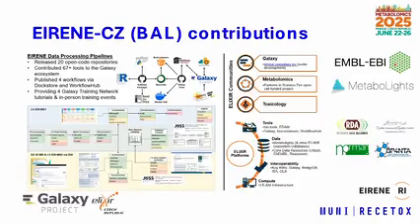So going there. Just as evidence of what we have contributed from my lab, I have to say again, I'm the analytical side. I just have a compute subunit run by Helga Hecht, who isn't here today. But essentially we've interacted and cooperated where we've provided multiple tools to the Galaxy ecosystem. We have 20 open code repositories. We create whole workflows to process our spectrometry data and make them public.